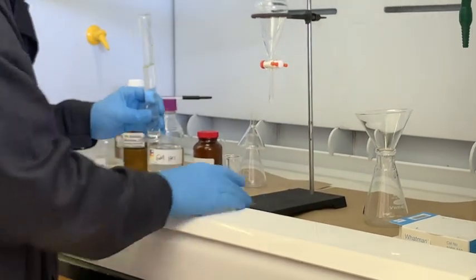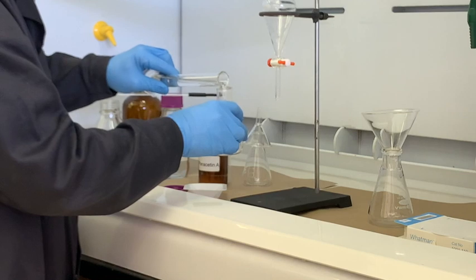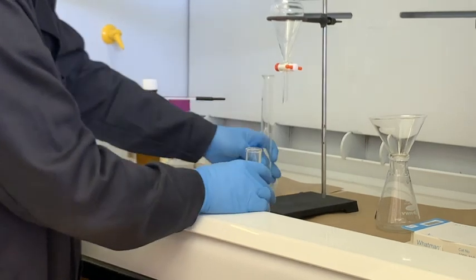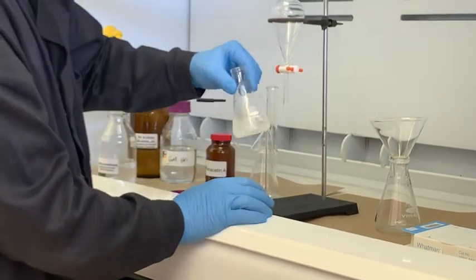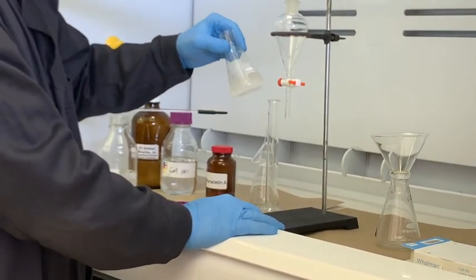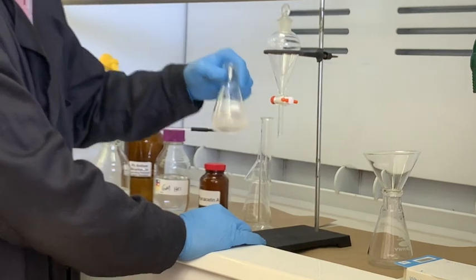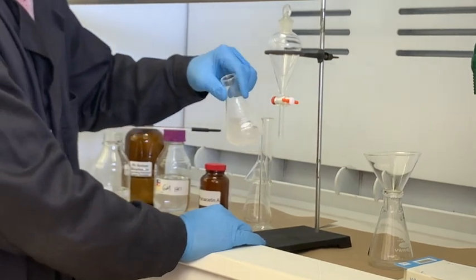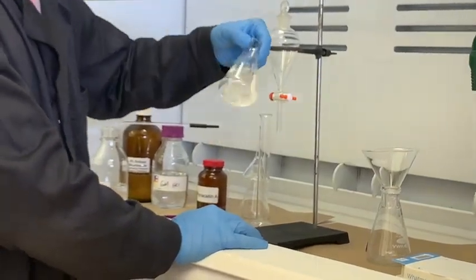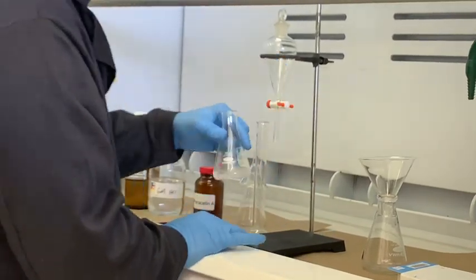We're going to place it in this Erlenmeyer flask, trying to keep it in the hood. The fumes in particular are pretty carcinogenic — it's very volatile with a low boiling point. By mixing this together, we're going to isolate all of the sucrose by having it remain as a precipitate, while the other compounds will easily dissolve into the DCM. It looks like we have some precipitate at the bottom that is not dissolving, and that's going to be our sucrose.